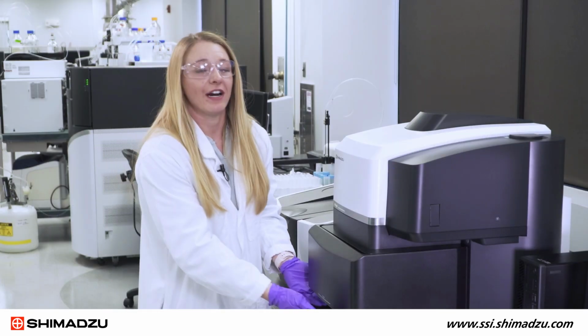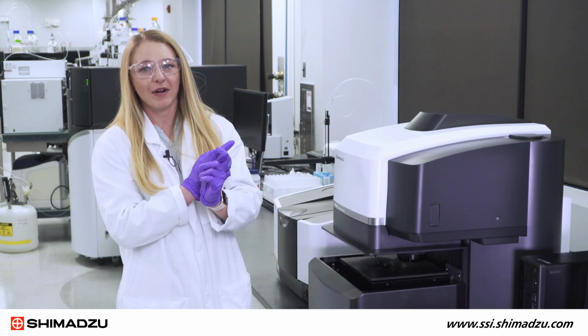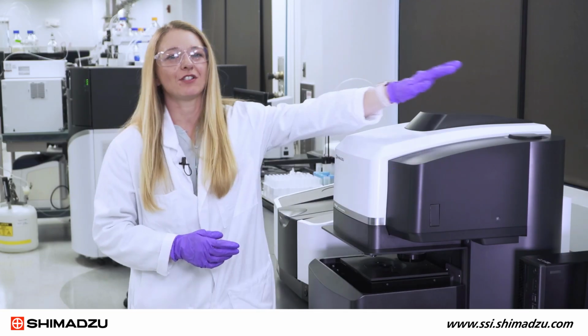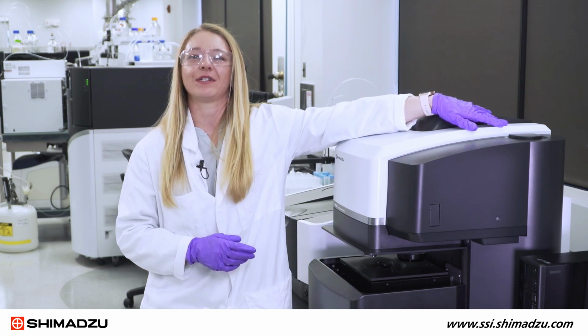All objectives required for collecting optical microscope images, FTIR microscope spectra, and Raman microscope spectra are all housed in the revolver here and are completely software controlled. Before turning on the FTIR bench or the microscope, the Type 2 Super Lattice Detector, or T2SL, in the AIRsight must be cooled with liquid nitrogen.